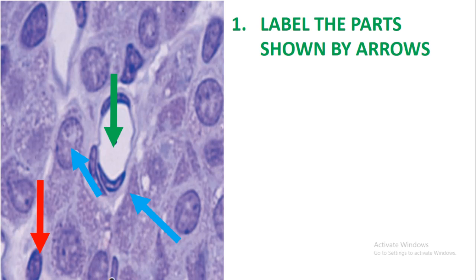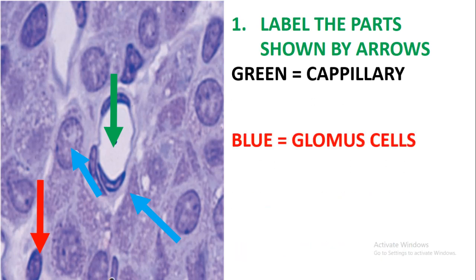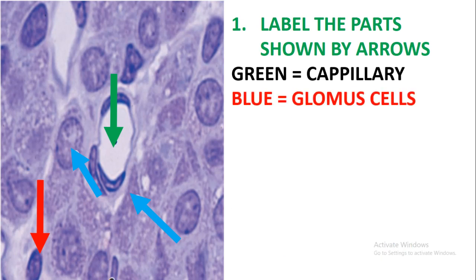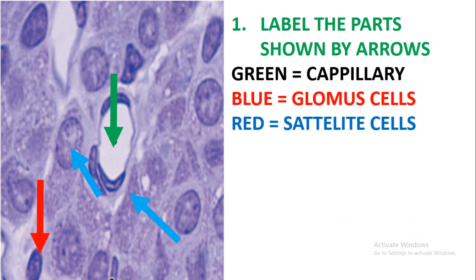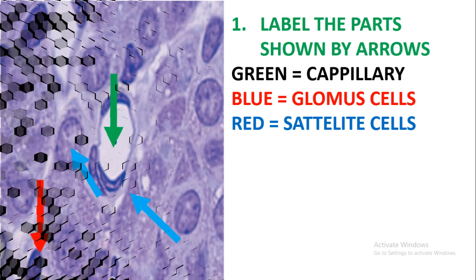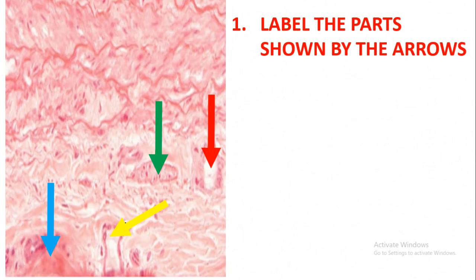Label the parts shown by the arrows on this slide. Green is pointing at the capillary, blue is pointing at the juxtaglomerular cells, and red is pointing at the satellite cells.